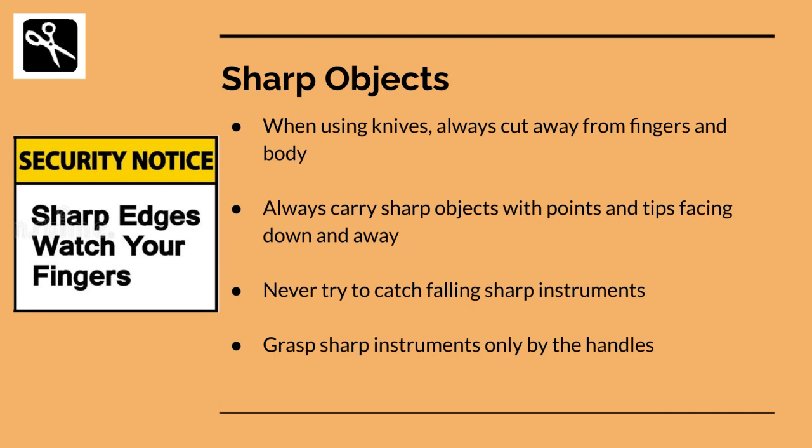In the case that would be a lab you would do, and especially even at home, this is something you should really do. You don't want to trip and then puncture yourself by hitting the countertop or whatever, and poke out an eye or hit your neck or whatever it is. Part of the lab, remember, is always just staying safe all the time. It's great to go to a lab and then go home with all your digits and all your ability to see intact.